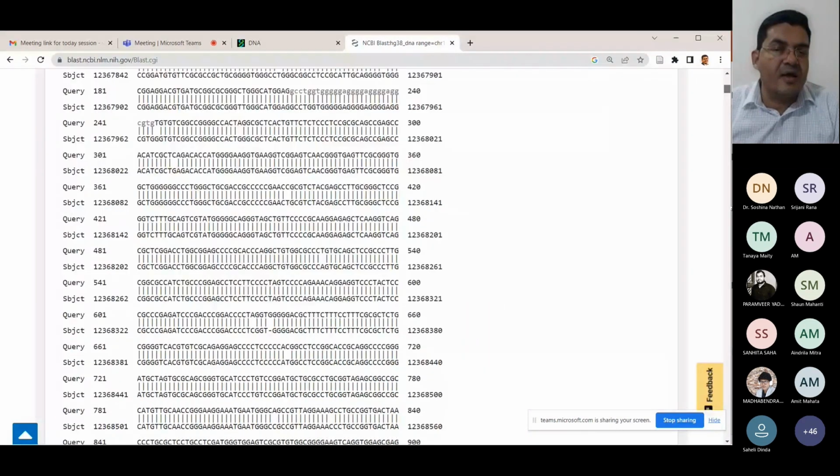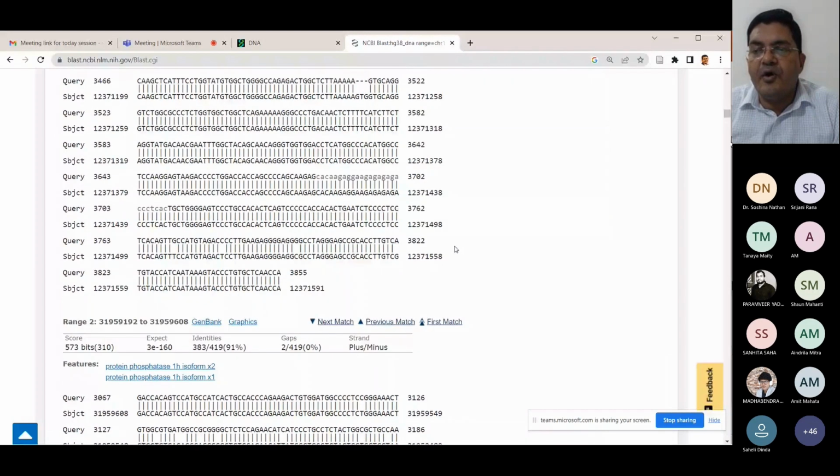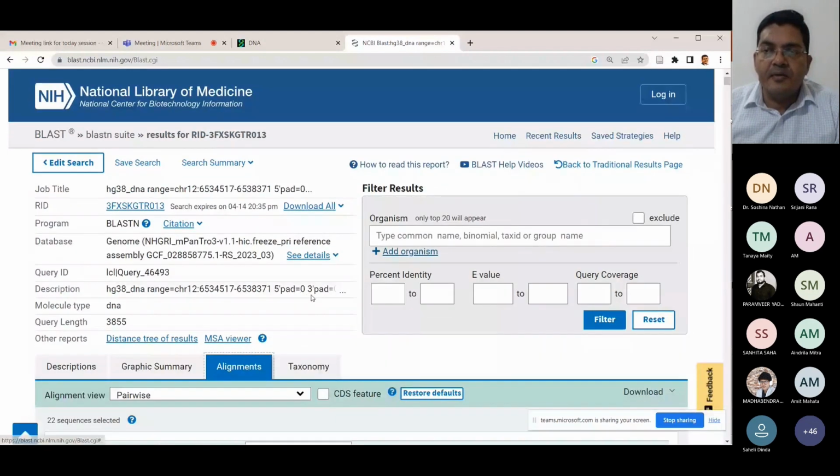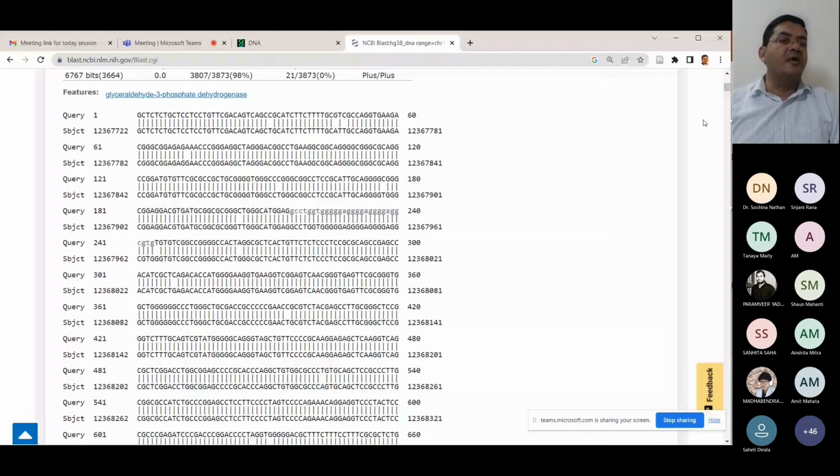And if you can see, this is the complete alignment here. This is the larger alignment, and then you have this small fraction alignment, the 31 base pair alignment, coming up here, right? So let's look at the best alignment. If you go down here, this is your alignment. How does the alignment come? Your query will be on the top. Your query would start with nucleotide 1, and continue until whatever portion of the query coverage has been matched.